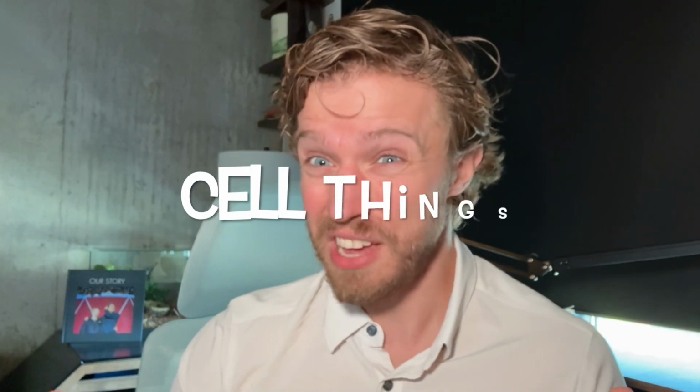Holotomography is when sci-fi actually meets science. The first time I was exposed to a holotomography image, I had that aha moment. I mean, I've studied cells in biology textbooks, and probably you have as well, but it's another thing when you actually get to see it in real time. They're doing cell things. The crazy thing about it is that it doesn't need dyes or labels.